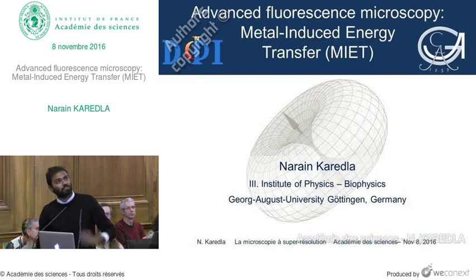So it's advanced fluorescence microscopies, but I'm presenting metal-induced energy transfer, which is a recent technique we developed in our laboratories, which has exciting results we want to share with you.